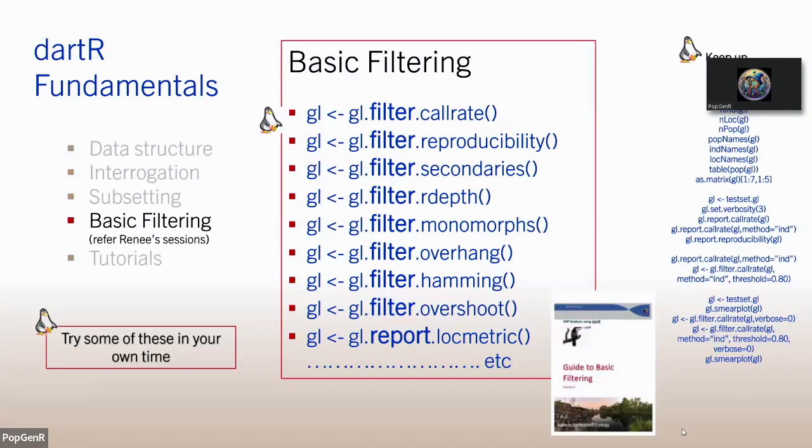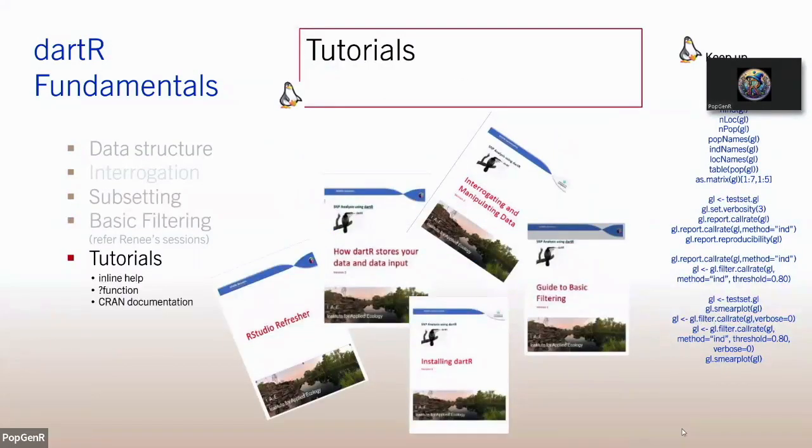Okay, so for the basic filtering that you can do, there's another guide, a guide to basic filtering. If you work through that, preferably with your own data set, because you know your own data set, just play with it and see what different thresholds do, before you launch into a major analysis, as Renee will say. Okay, so here are the tutorials.